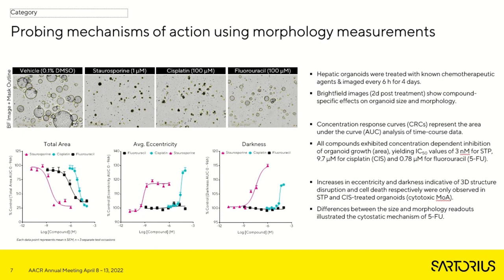The representative images and concentration response curves constructed from the area under curve analysis of the size, eccentricity, and darkness time courses demonstrate a difference in profiles between cytotoxic and cytostatic compounds.